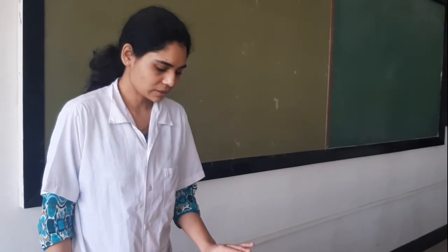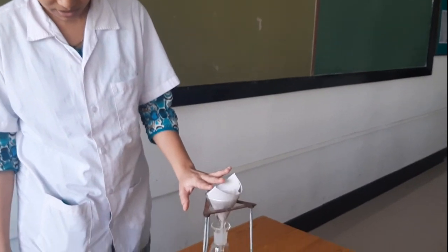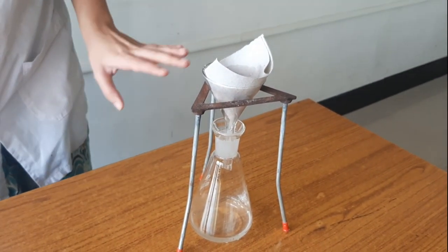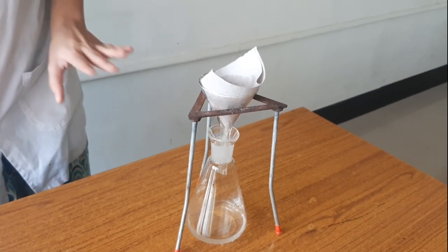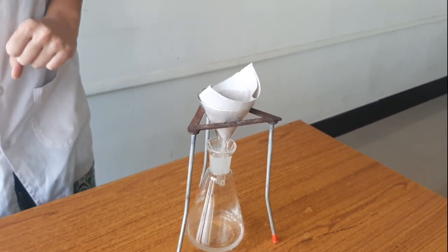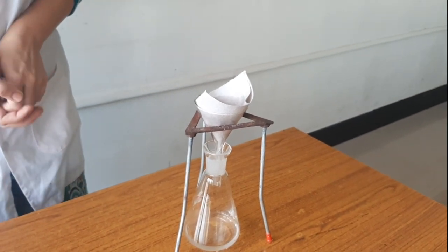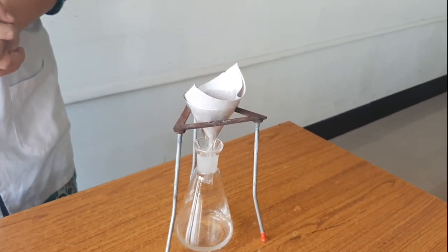So now as you can see here, we have achieved our last drop. It just fell, and we are at the end of 8 minutes and 58 seconds. So we can say this filtration completed in 8 minutes and 58 seconds. Now we will proceed to our part B.